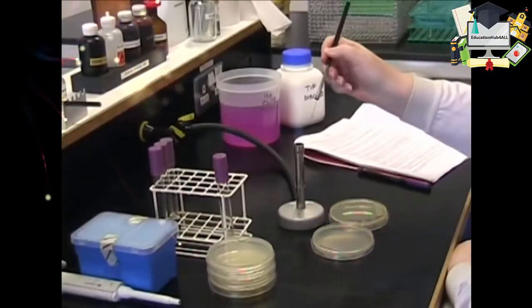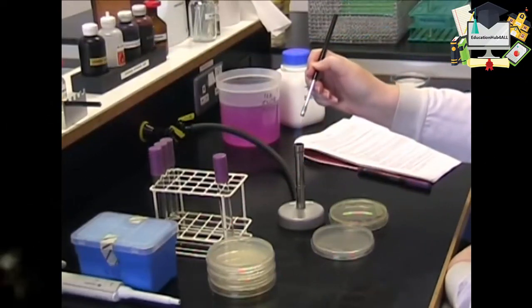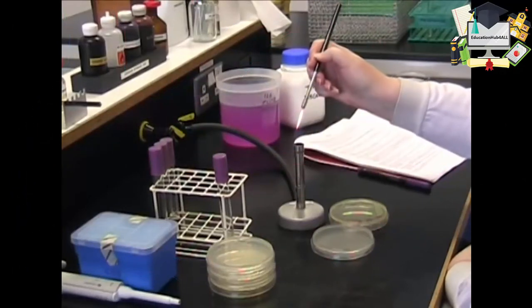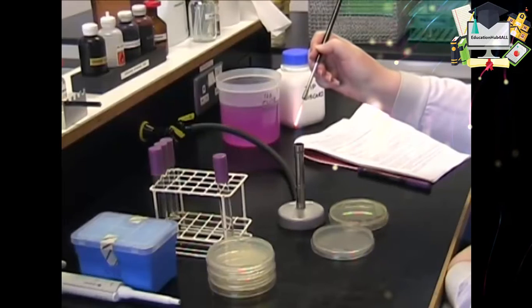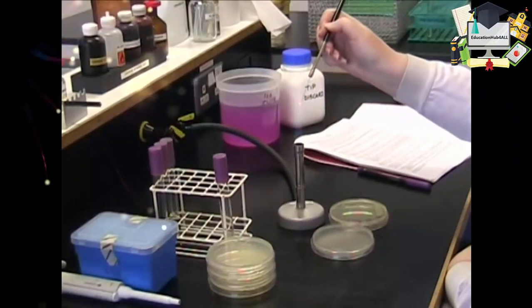At this point it's important to remember when flaming your loop between inoculations that you do not cause any residue that might be present on the loop to splutter. So it's important to draw the loop very slowly up through the flame, especially when you've finished your work.